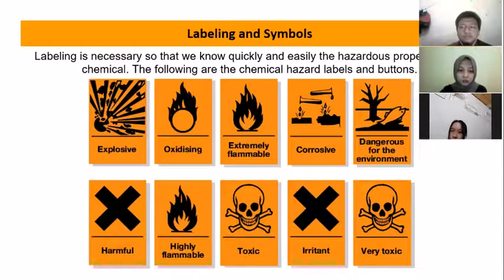Harmful, hazard: cause minor damage to the body. Example, pyridine. Safety: avoid contact with the body or inhalation. Seek medical attention immediately if poisoning is possible. Corrosive, hazard: corrosive or damaging to human tissue. Example, chlorine and sulfur dioxide. Safety: avoid inhalation.